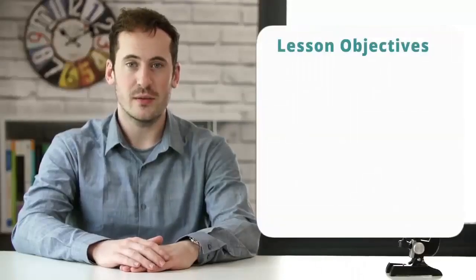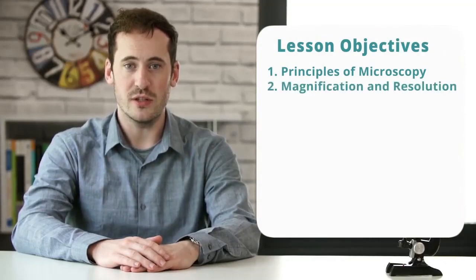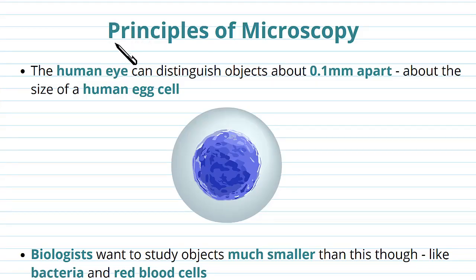Hi guys, in this video we'll be looking at the principles of microscopy, magnification and resolution, the light microscope, and then we'll finish with a summary. So we need to understand how microscopy actually works before we delve into how the microscopes work as machines.